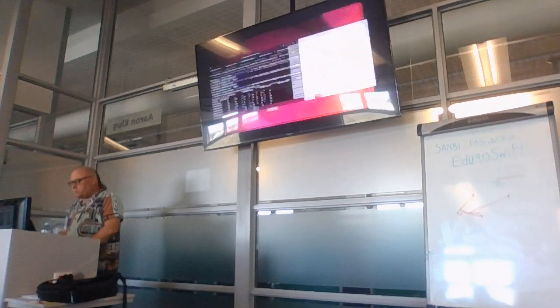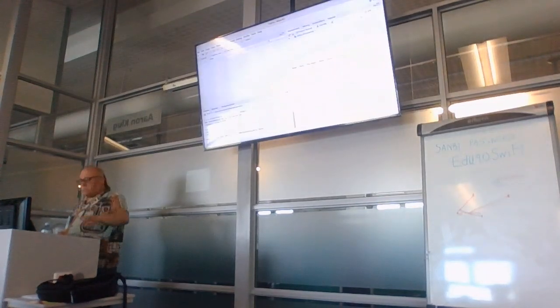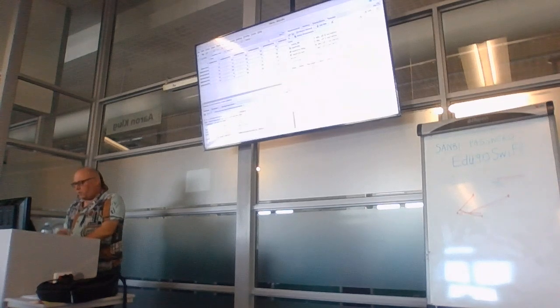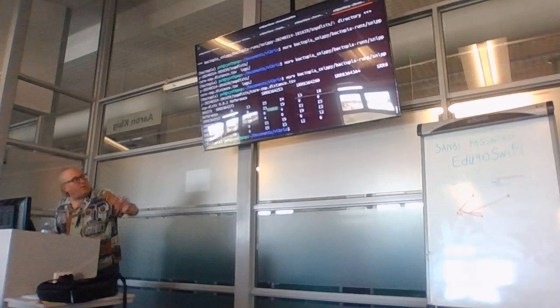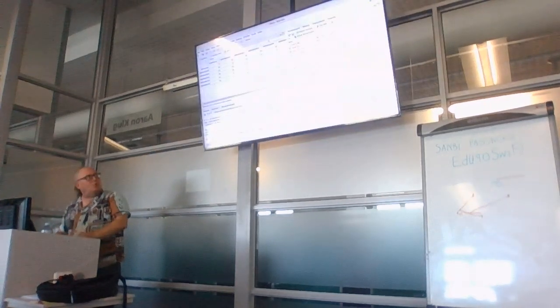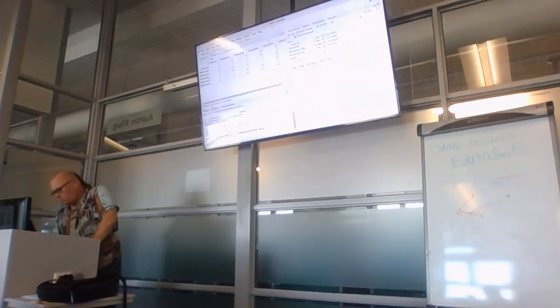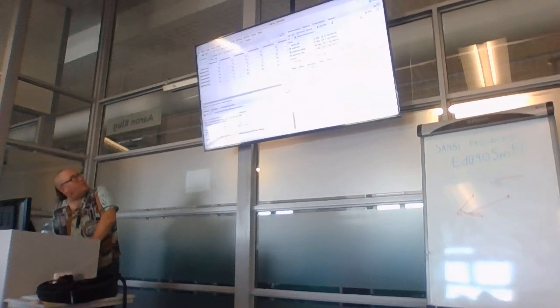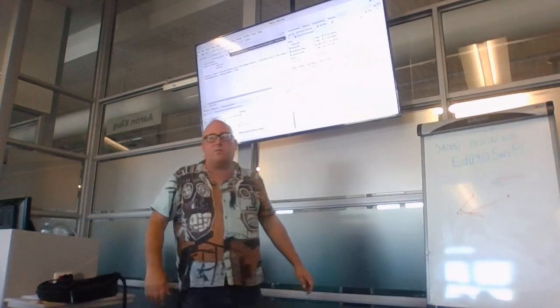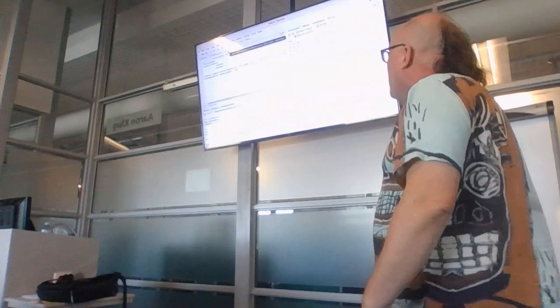Let's fire up RStudio. I've done all of the work, so let me show how I got to here. I take that file from the Bactopia runs, Snippy, and then the snp dist folder, the core snp distance.tsv. I'll put this in the notes when I get around to updating the website. And I found a nice little R package for plotting heat maps.